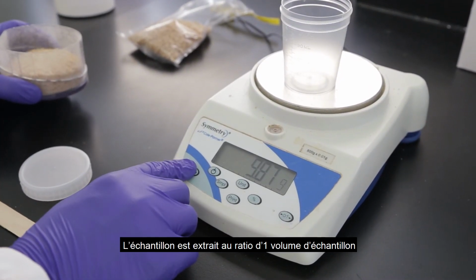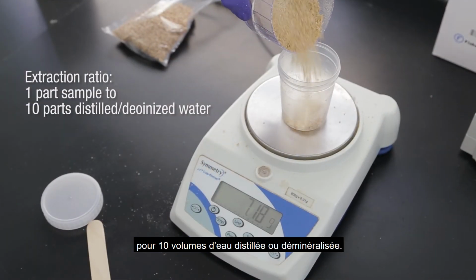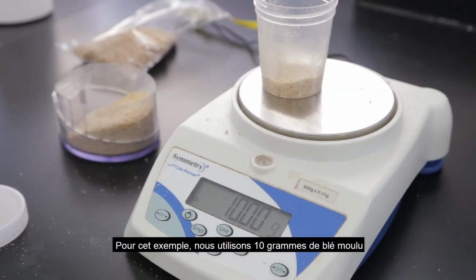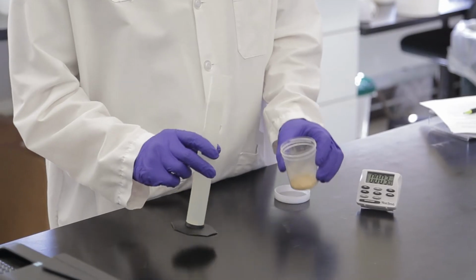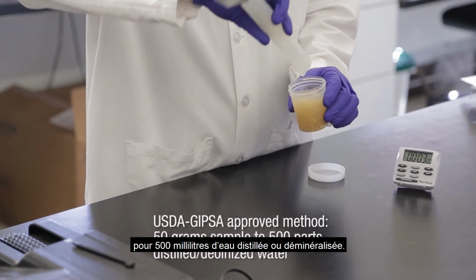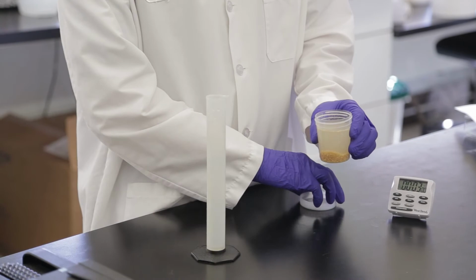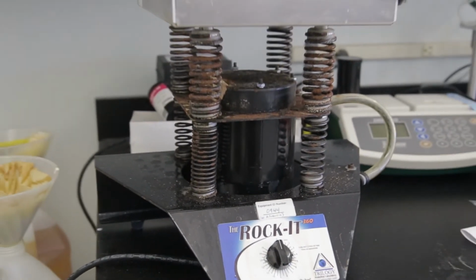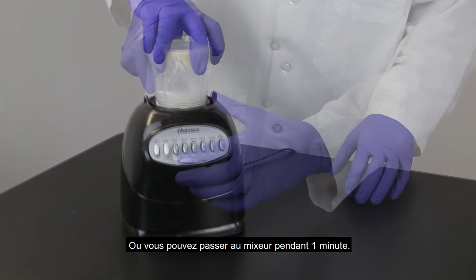The sample is extracted with a ratio of 1 part sample to 10 parts distilled or deionized water. For this example, we'll use 10 grams of ground wheat with 100 milliliters of distilled water. The USDA GIPSA approved method uses 50 grams with 500 milliliters of distilled or deionized water. Vigorously shake by hand or mechanical means for 3 minutes. Or you can blend the sample for 1 minute.